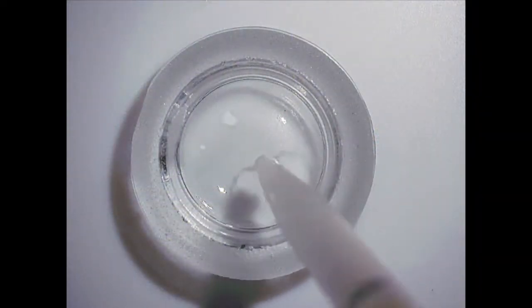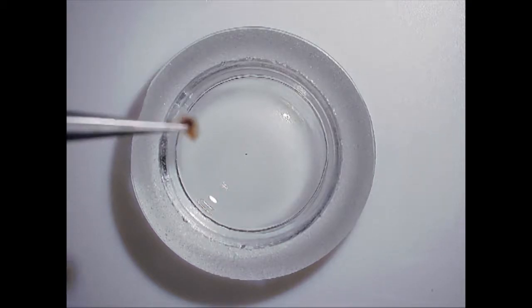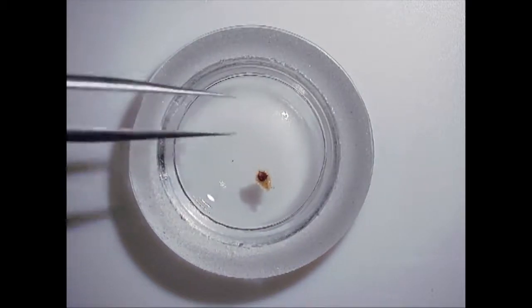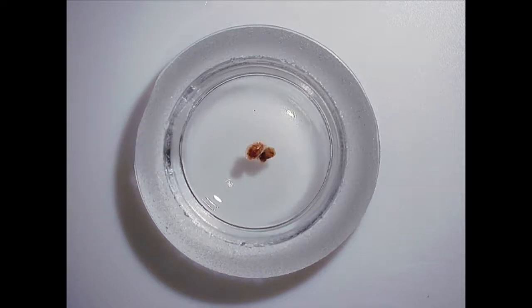This is a clearing step. I'm filling the dish up with 10% KOH, about halfway full or so. Here's the adult female on the forceps. Put it right in. It's always a good idea to collect a couple specimens. And then from here, what you want to do is place this on a warming tray or hot plate. Make sure not to overcook it. And you can also cold soak this overnight if you have more time to allow for the clearing of it.